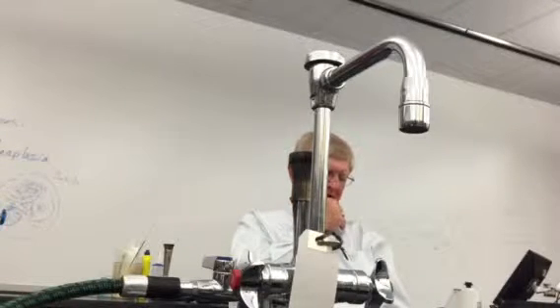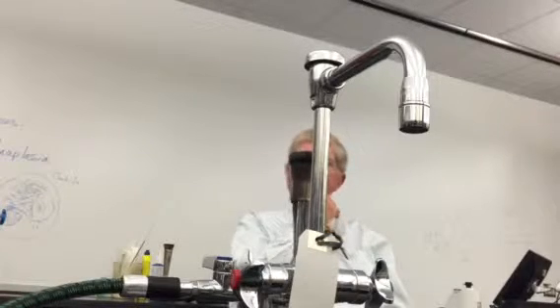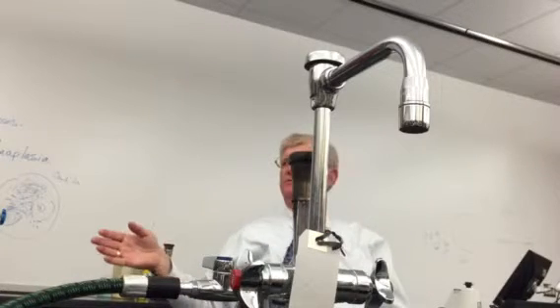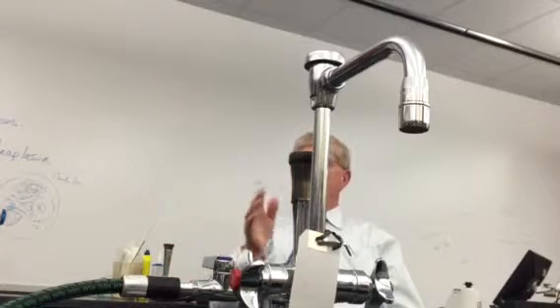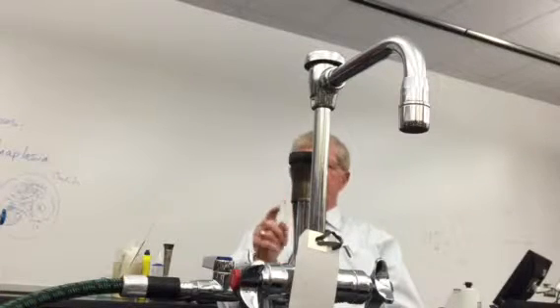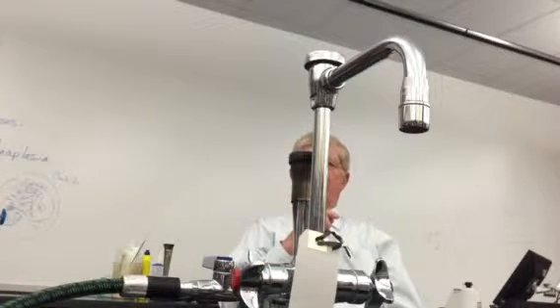So now we're at 5.2 through 5.19, and these are those biochemical reactions. I can easily summarize what you have to know here. The handout that we used the second lab period of those 2 weeks is in chart form.